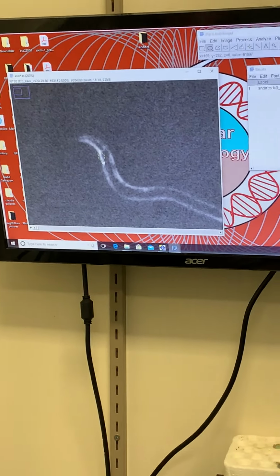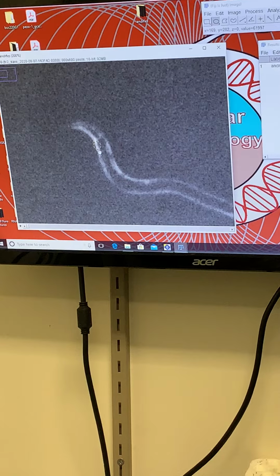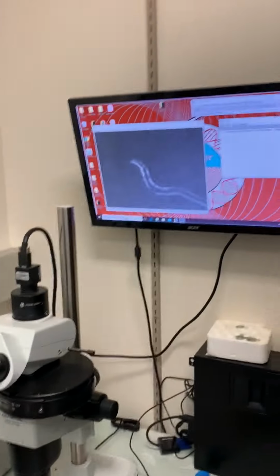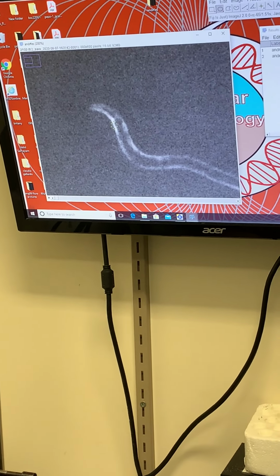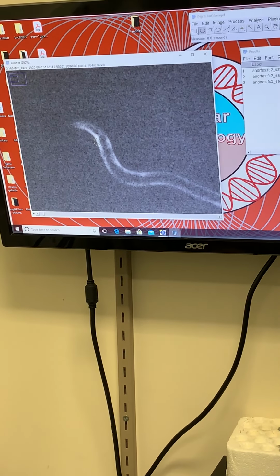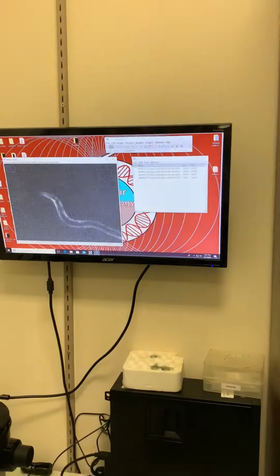Now you can click on the advance to go one frame ahead. You can click on this arrow here, or you can click on the back arrow to go all the way back to the beginning. And so I advance to the next frame, and I will reposition this thing, and I will press M again to get the next value. I advance to the next frame, reposition, M, advance to the next frame, reposition, press M, and so on.